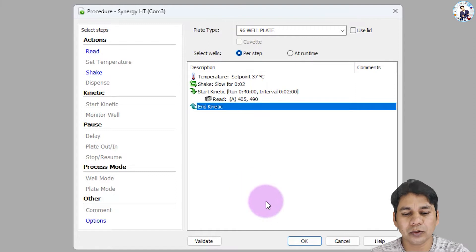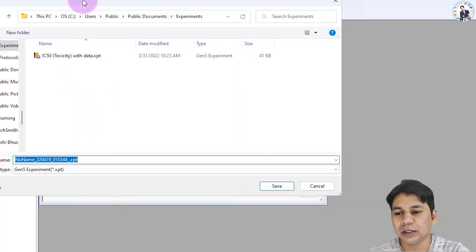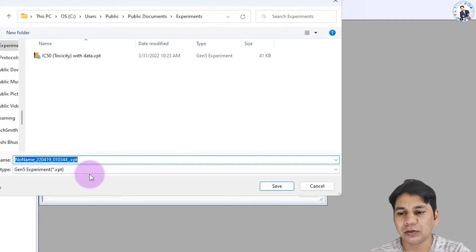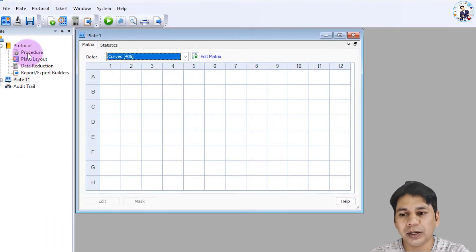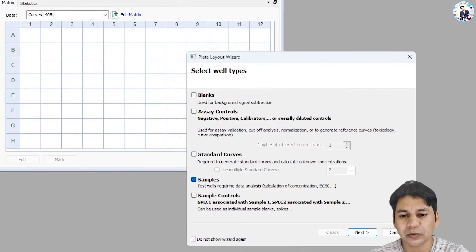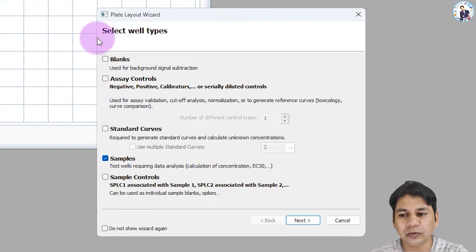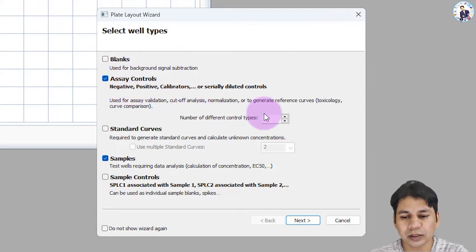Click OK, which opens the option to save the experiment, so I am saving this experiment. The next step is plate layout. If you double-click here, you can see a new window for the layout. This clinical assay has two assay controls — positive and negative — a standard curve, and samples. Click on Next.